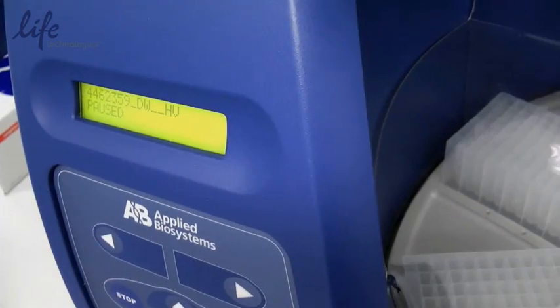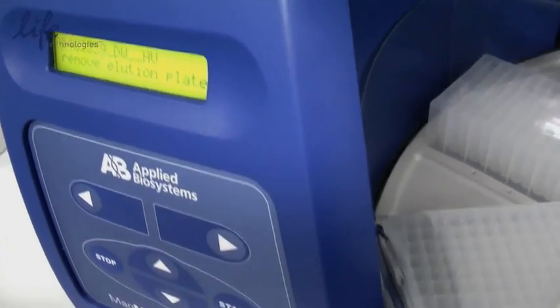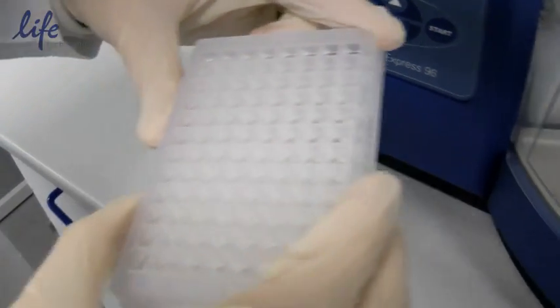At the final step, the nucleic acids are released into the elution solution. The beads are removed but the nucleic acids remain in the plate.